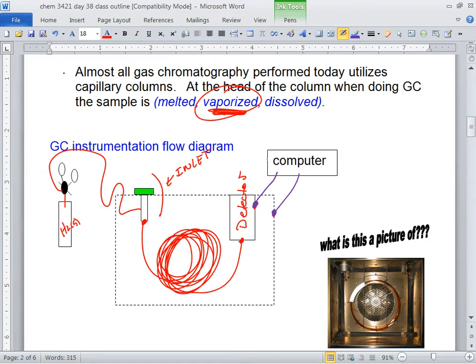My computer better know when it was injected, so somehow there has to be some information coming over there. Now this dash box, I guess the computer's also giving you feedback on the mobile phase too, to make sure there's something there, but I don't think it's too active, because if it runs out, the GC doesn't know it and we can destroy our column. So maybe newer versions are better.